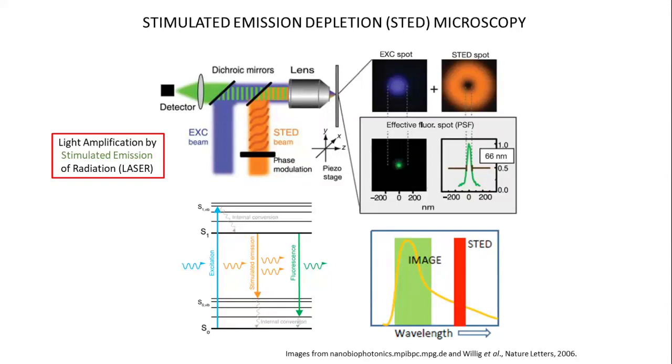And here, in this demonstration, they're basically saying that the effect of stimulated emission from that donut shrinks it down to something like 60 odd nanometers, so well below the normal performance of a confocal microscope. And it's really because of this zero there. And the fact that once you're switched off, you're off, and you can basically turn it up until everything's switched off. But because there is that zero, there is still stuff that's on right there in the middle.